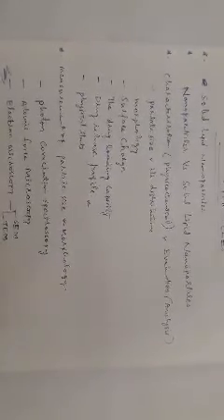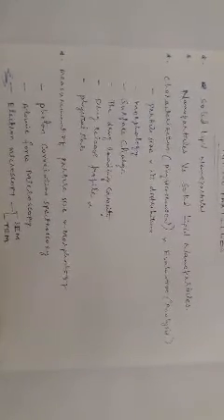The principles and methods behind measurements using the Zeta sizer are as follows. The main principle of any kind of measurement using a Zeta sizer is light scattering, the scattering of light by the nanoparticles from their dispersion.